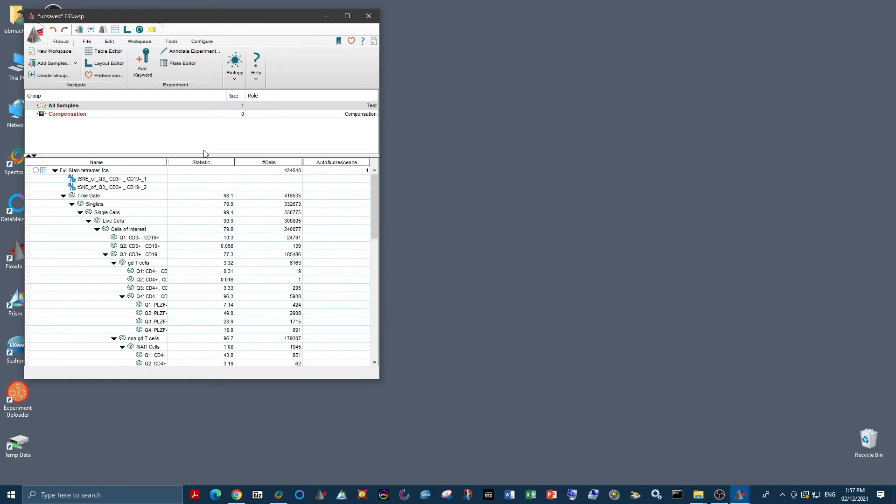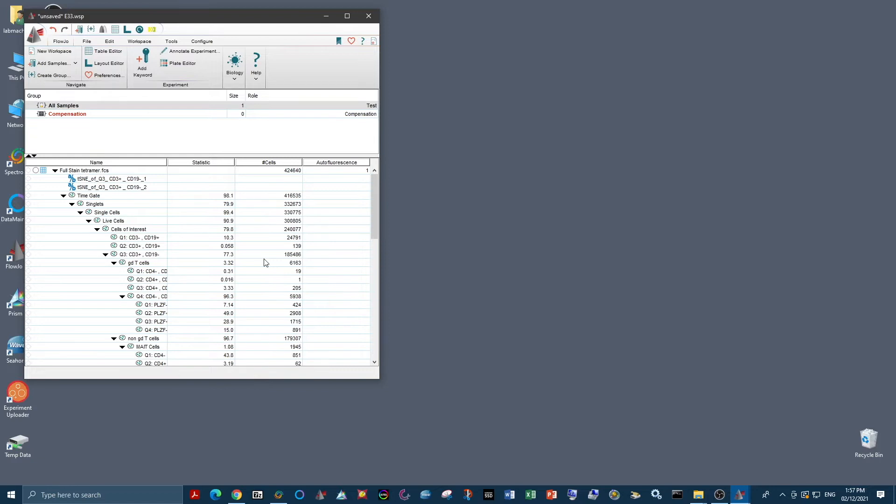So I have opened my fully stained unmixed sample in an FCS file analysis software. You can use any that you like, today I'm using FlowJo 10. And this protocol just runs through using a gating strategy to check that your unmixing has worked as expected, and then using a dimensionality reduction tool to do a secondary check.